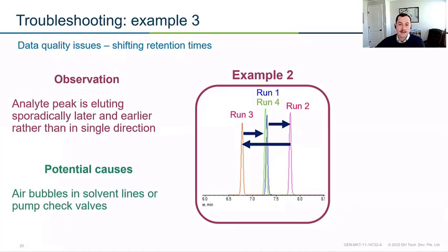More likely than not, this is just caused by some air in your lines. So we talked about purging. I always like to purge in the morning. It's really easy to do. Just go ahead, purge your A line and your B line and your rinse line if you have one. And take the 2 minutes and eliminate this problem.